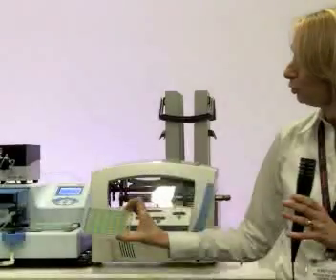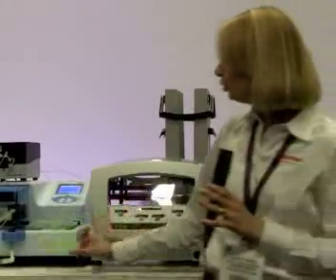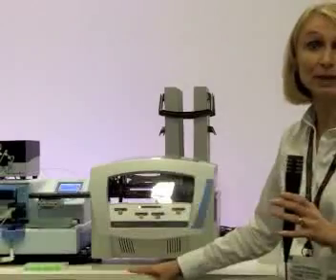We have a slightly blue and a slightly yellow in every other well, but you can do a variety of dispenses, pretty much any type of dispense that the Multi-Drop Kombi can do. The valve can help enable it to dispense multiple reagents.